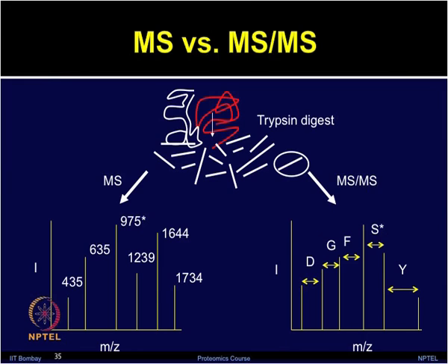The first stage does selection of an ion for its subsequent fragmentation, and then in the second stage, this ion is fragmented by using different types of fragmentation methods such as CID or ECD, and then sequence information may be obtained via de novo analysis of the spectrum.